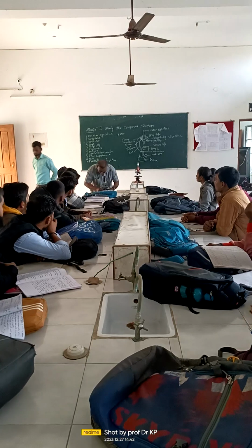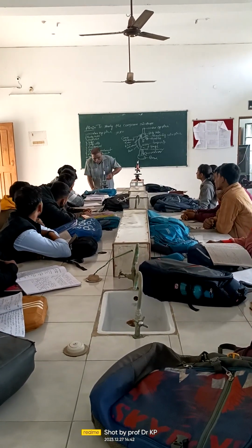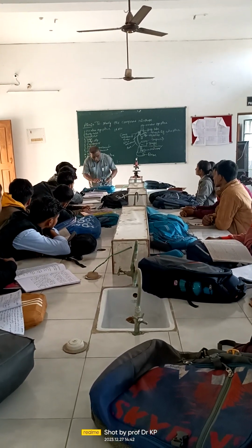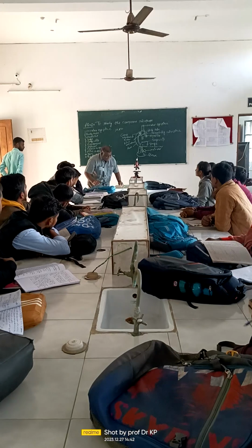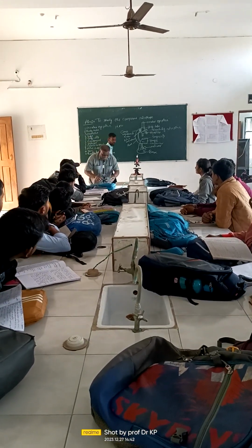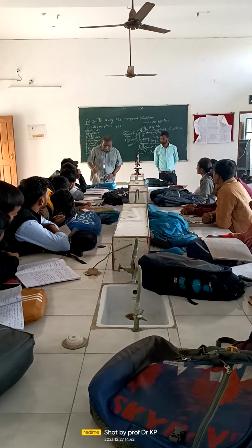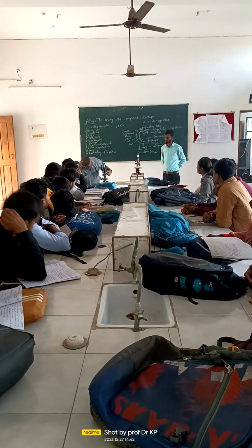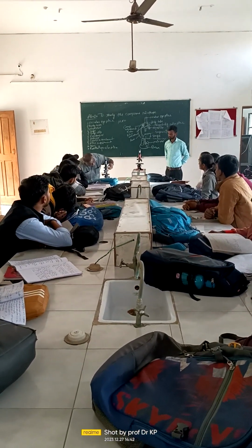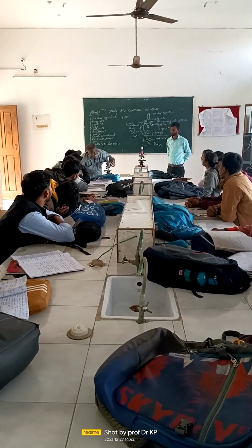Then what are you going to do while focusing? First thing, you have to raise this body up as much as possible and place the slide. Now the slide is placed. Now, looking from outside and with the help of the left hand, lower it as much as possible without touching the slide, because with 10x and 45x you should not touch the slide and break it unnecessarily.